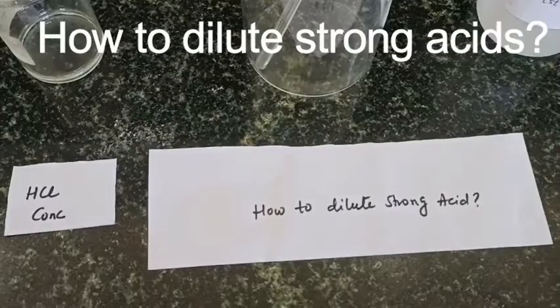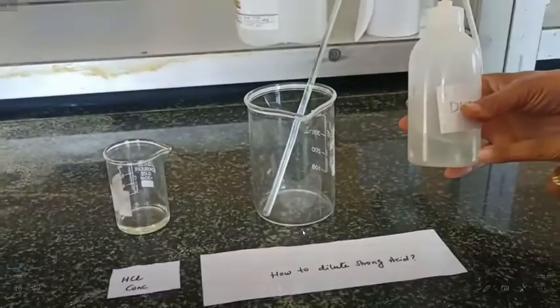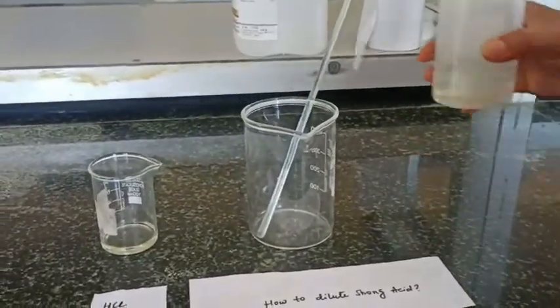Hello everyone, welcome back to Spectrum Classes. This is another lab activity video in which we are going to discuss how to dilute strong acids. This is very useful for beginners, and for safety reasons this video is very useful.